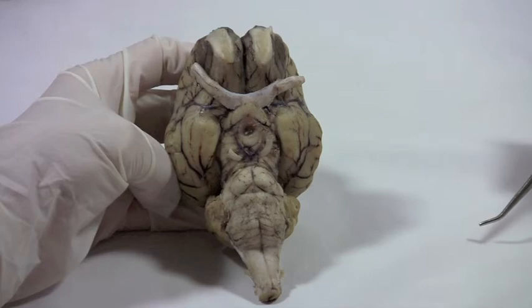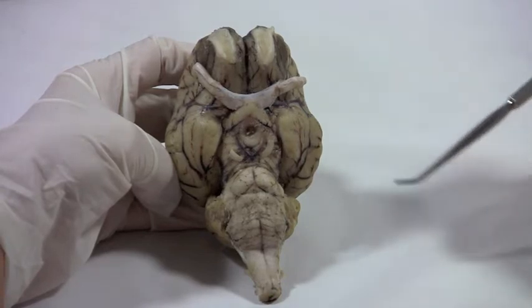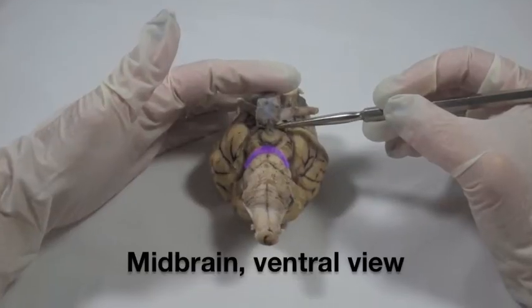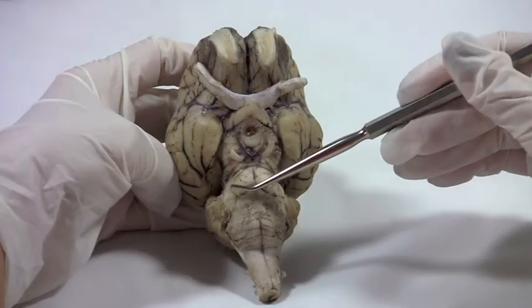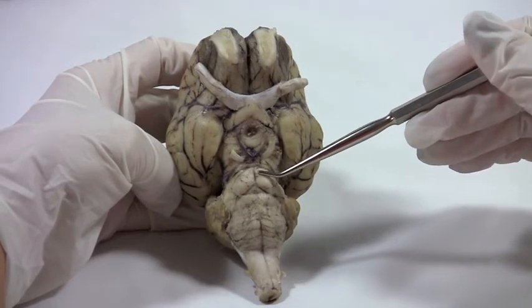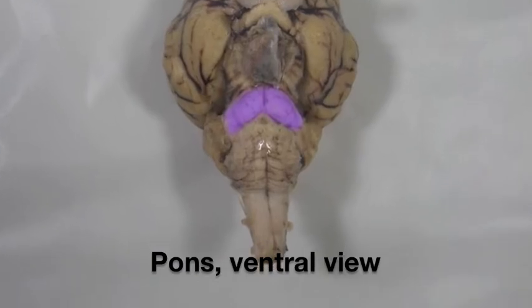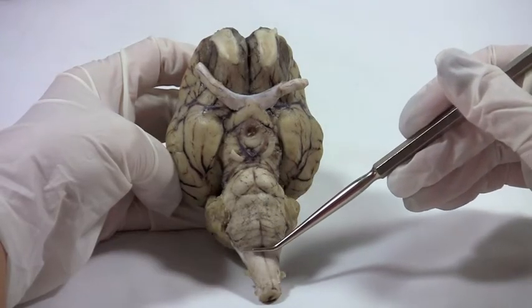In this video, I'd like to examine the brainstem in a few different views. Let's start with the ventral surface where we can see all three parts of the brainstem. This is the midbrain, the pons, and the medulla oblongata, also known as the medulla.